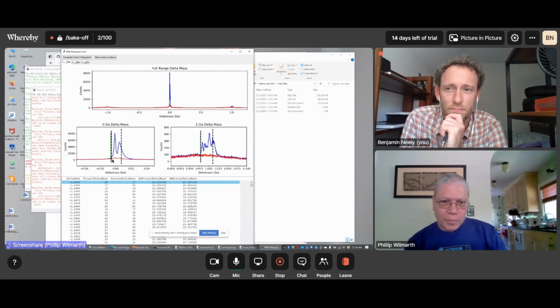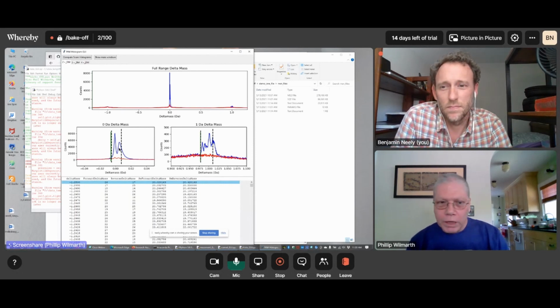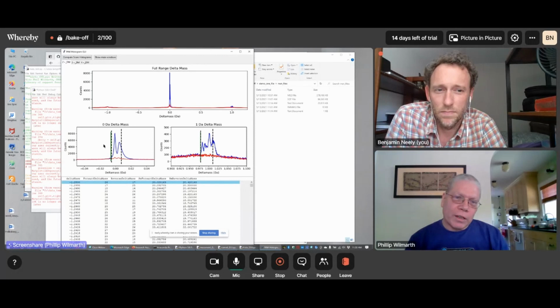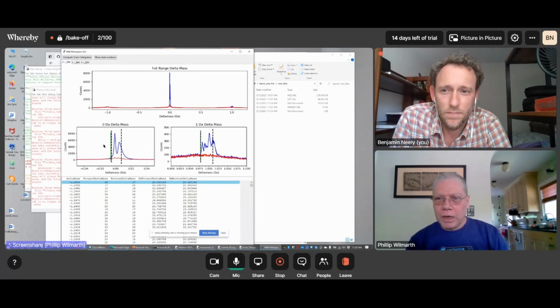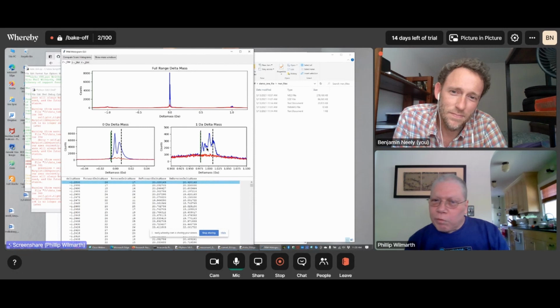But we also see here, and this is one of the nice things about the pipeline, it integrates a lot of quality control information. You see that we have 2 peaks at 0 Dalton instead of the expected 1 peak. And the data was collected in 2 chunks in May and June. So what's likely happening here is we've got a little bit of a systematic mass shift associated with one of the times and not the other. And then over here at 1 Dalton, we'll have 2 peaks. That's now 4 because of the mass shift.